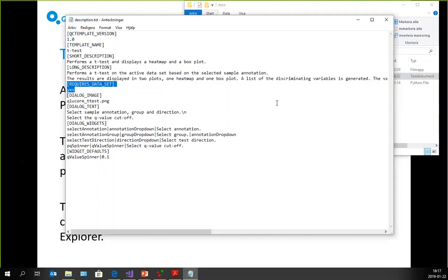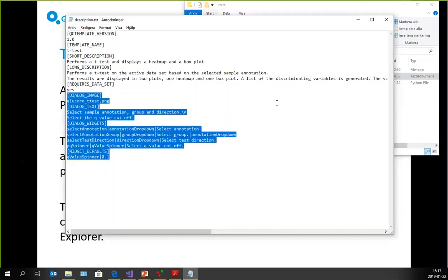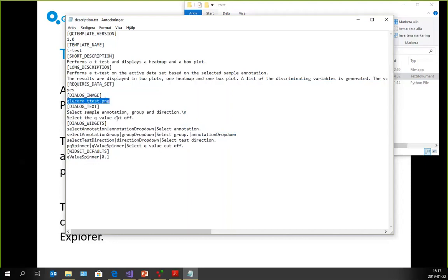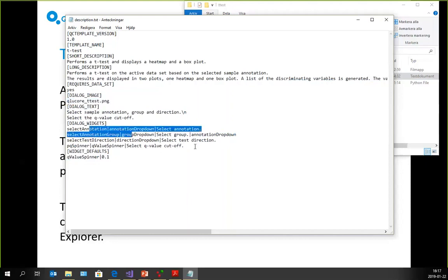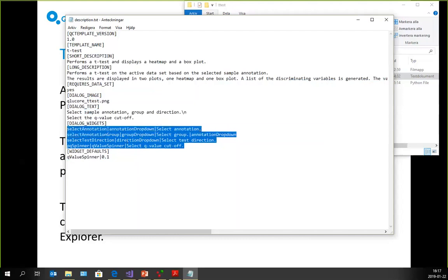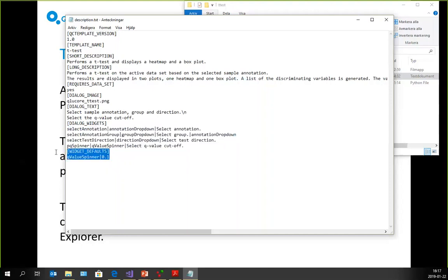The template also has an initial user interface specified in the configuration file. In this case, the user interface contains an image, some text, and a few widgets — user interface elements that can be interacted with. There's also something called widget defaults, which sets one of the widgets up to have a default value. The spinner widget here is called QValueSpinner and is set up to start at the value 0.1, which is a reasonable value for a Q-value.